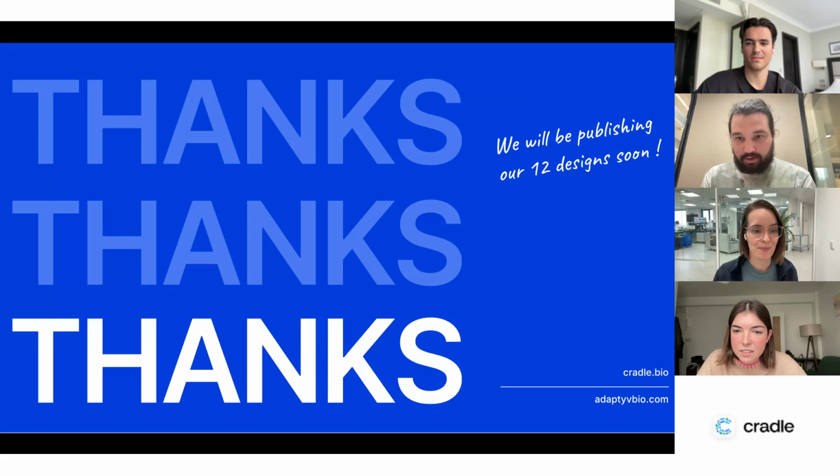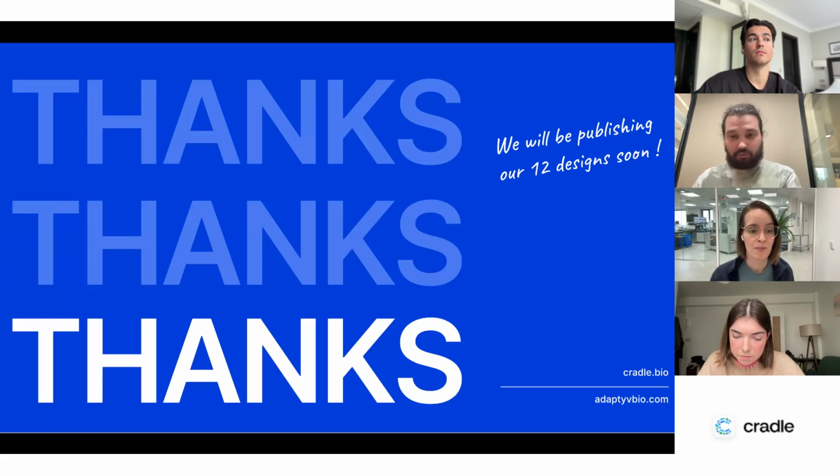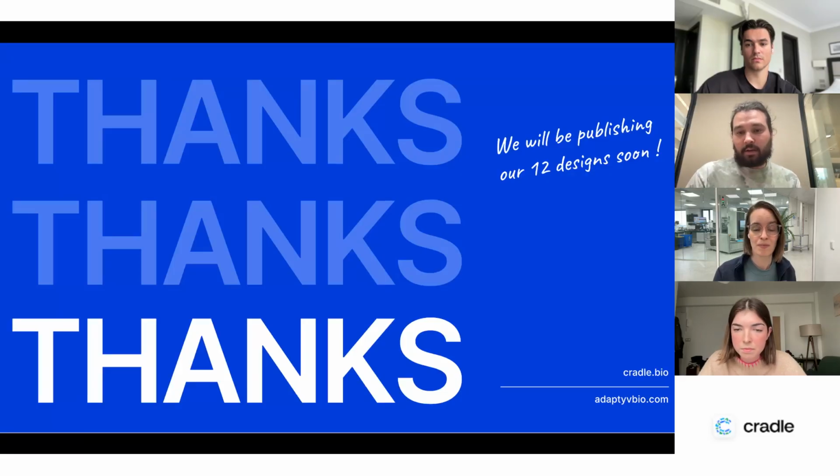So you can't yet start with just a target, but what you can start with is screening data against a target where you've not yet identified a hit. So this might be panning data from a phage display campaign or FACS data. And what we've demonstrated a few times in-house, and hopefully will publish about soon, is that we're able to identify hits within this set and then actually diversify them like we did here in that initial round, along with the identification. So not yet full de novo, really focusing first on the later stages of the optimization pipeline, lead optimization and hit identification. But we do feed that NGS data directly into our models and use that in initial rounds.